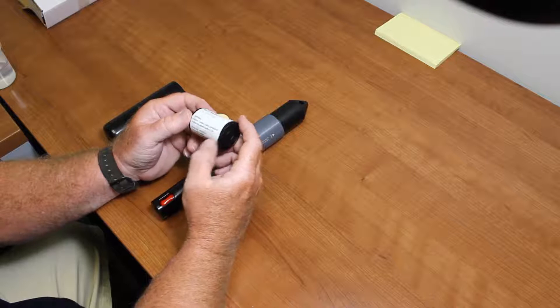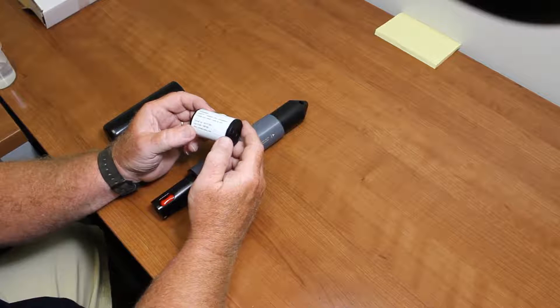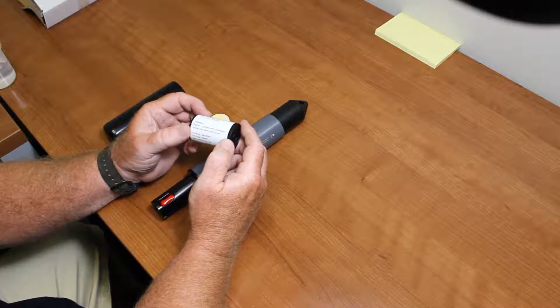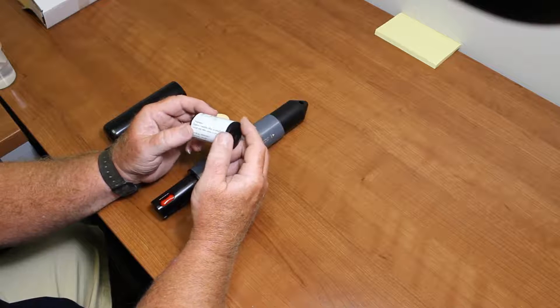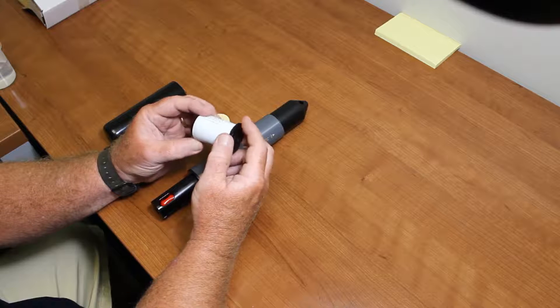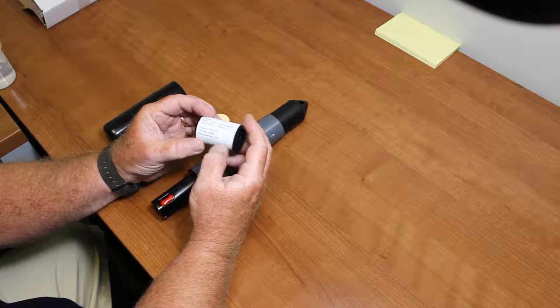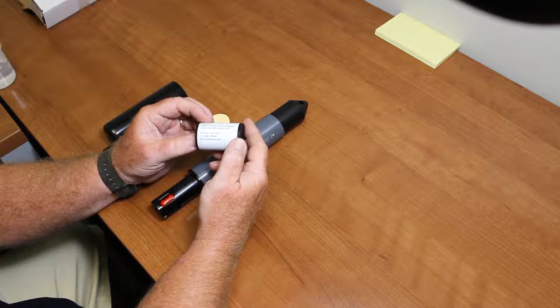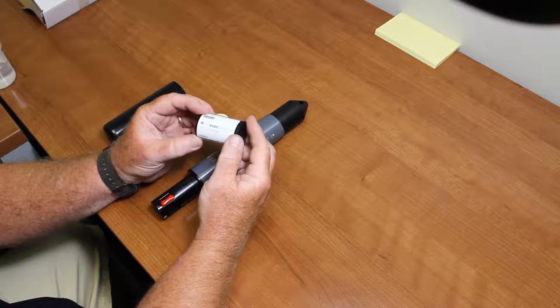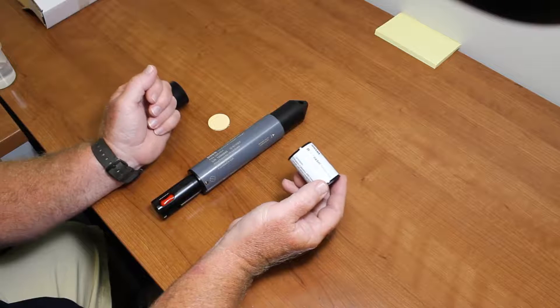This has a six-month life once it's activated. We give you an extra month, so it's seven months. But it will let you know in the software if the cap is expired. You can see here it says installed by 10/31/2017 right on the housing. This is a brand new logger right out of stock.